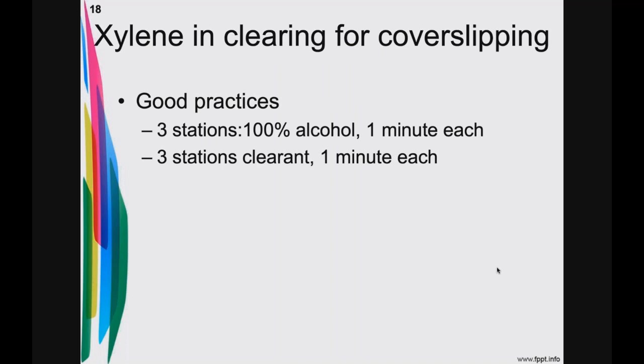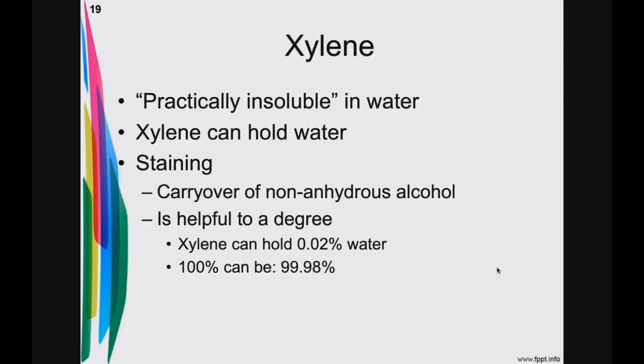Good practice: you always want three stations of alcohol, 1 minute each, with three stations of your clearant. Your first clearant is always going to have carryover of the final 100. So you want to make sure that what's on that slide is pure xylene and not with any degree of alcohol in it.